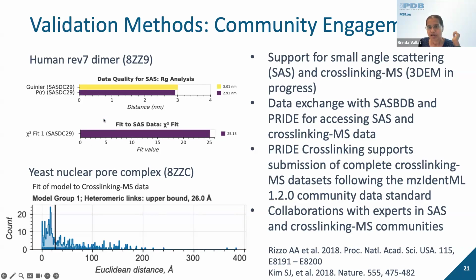Here I show selected plots from sample validation reports specific to SAS and cross-linking MS, and all these were generated in collaboration, in extensive discussion with experts in the community.